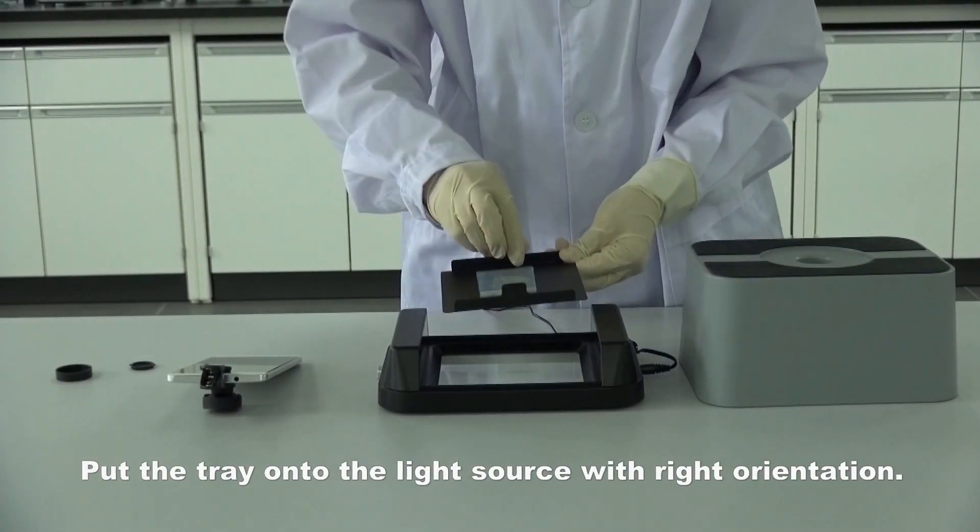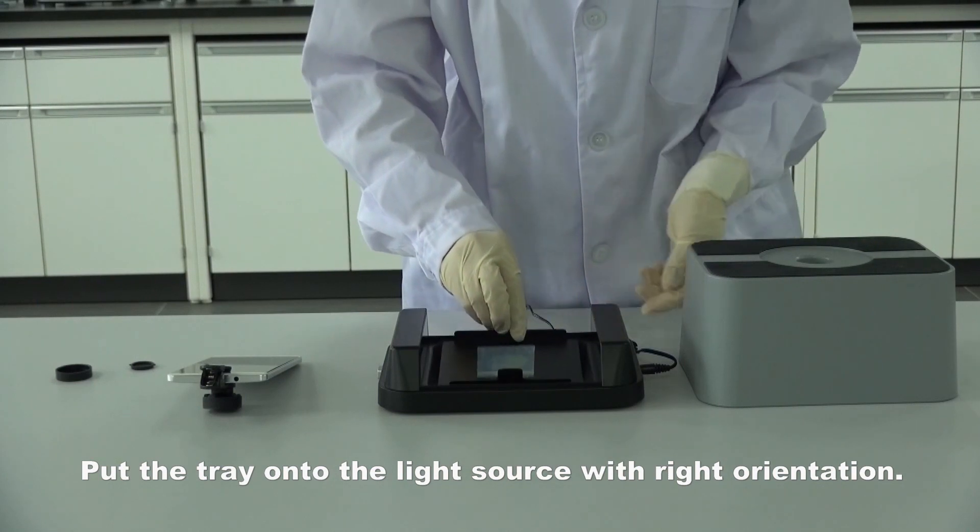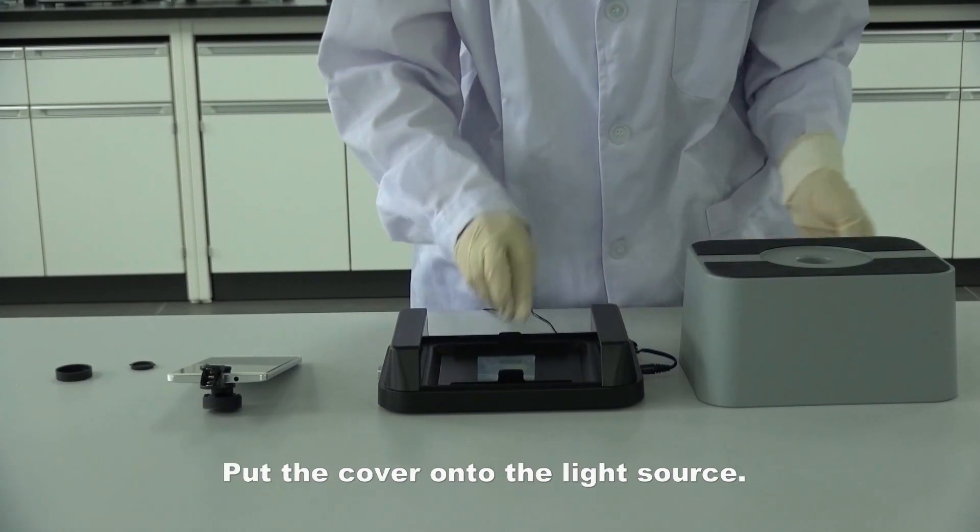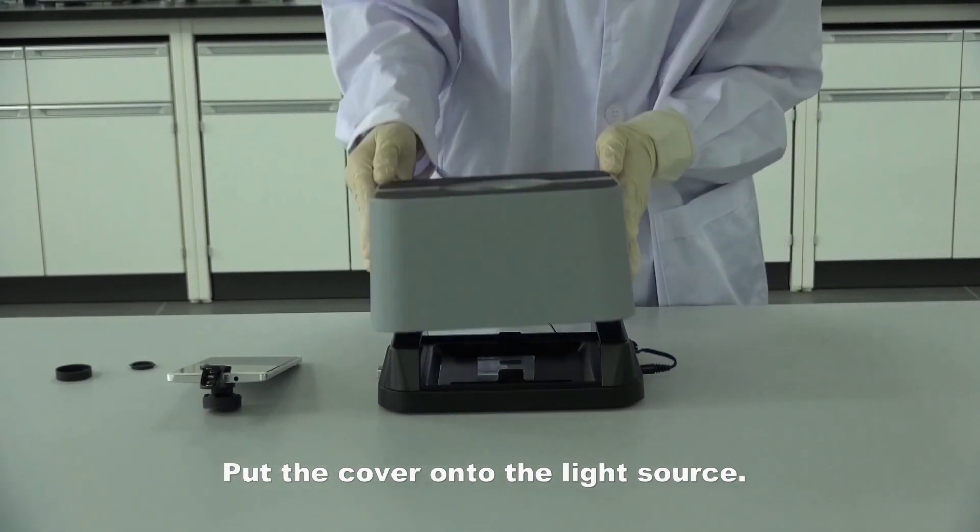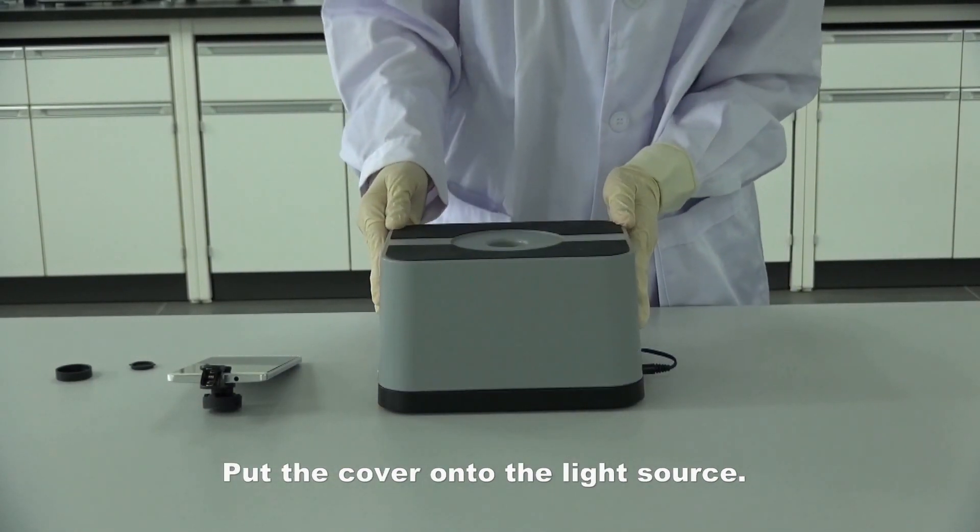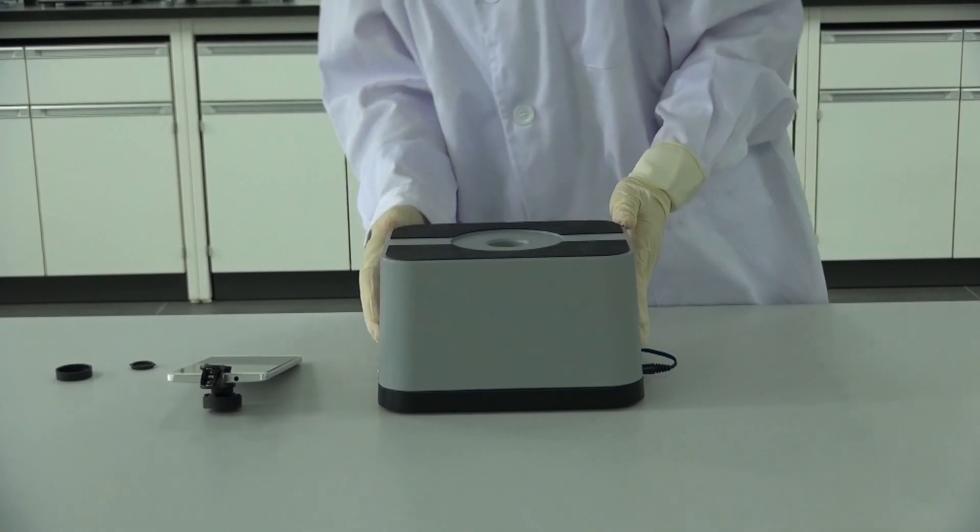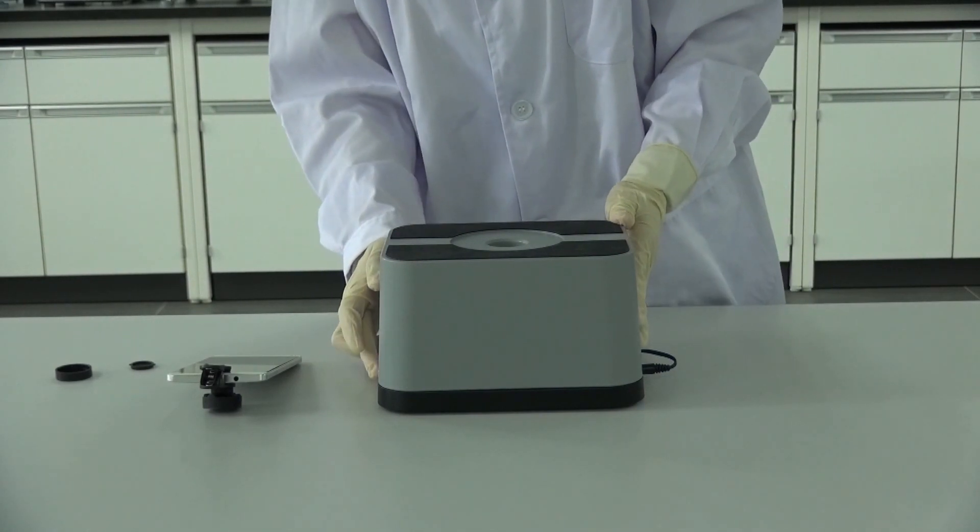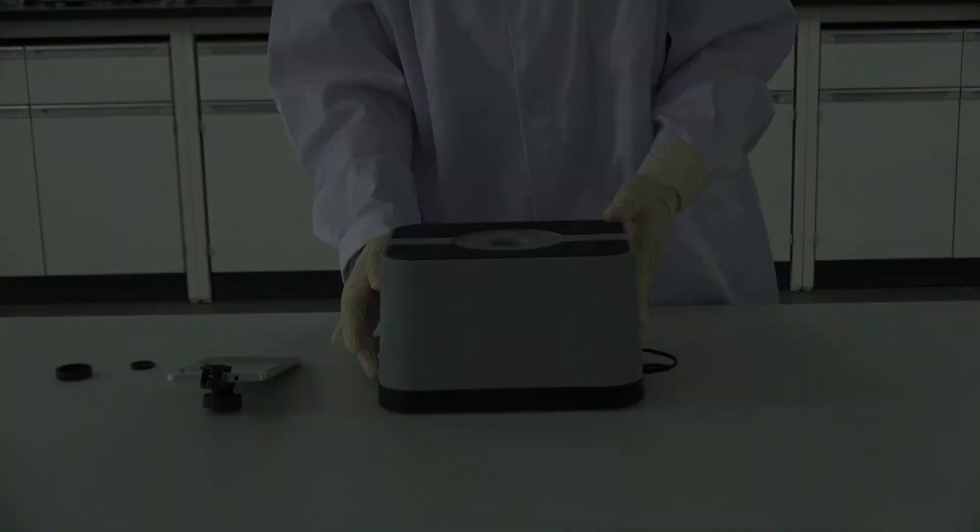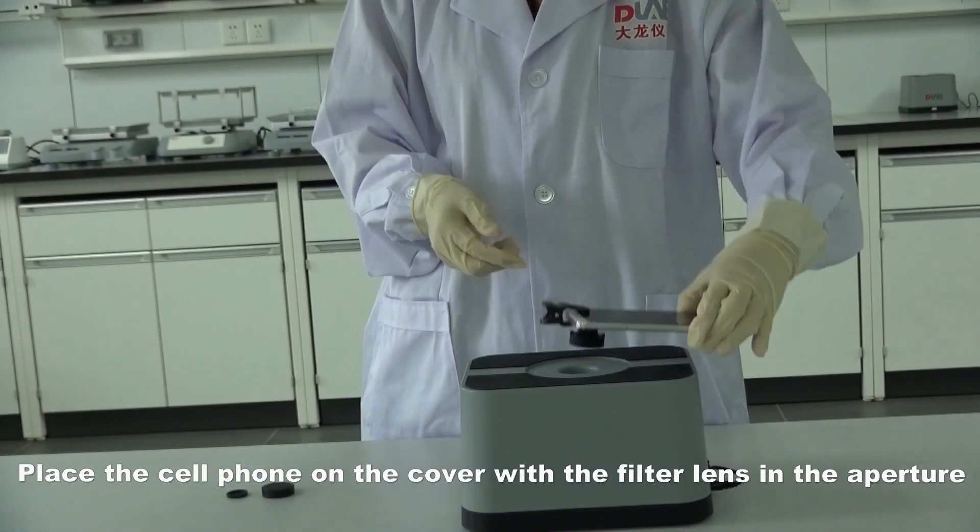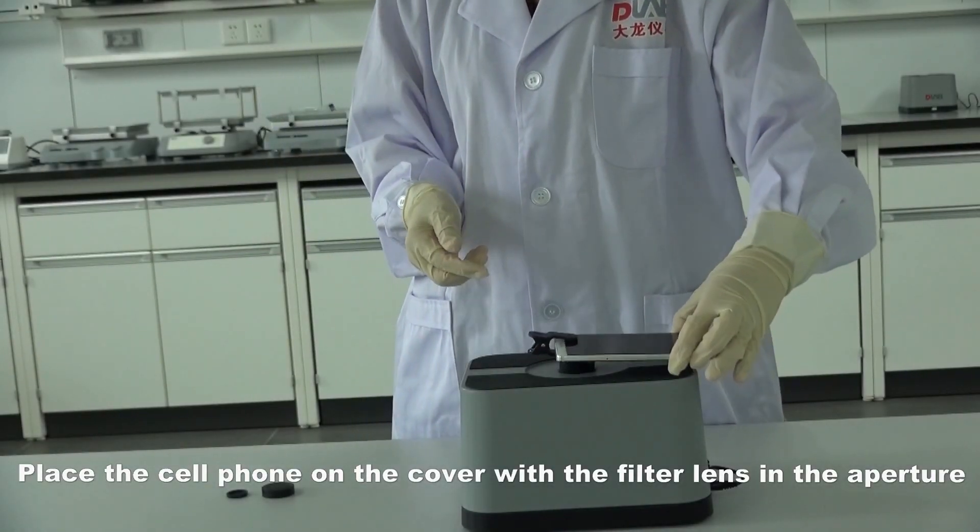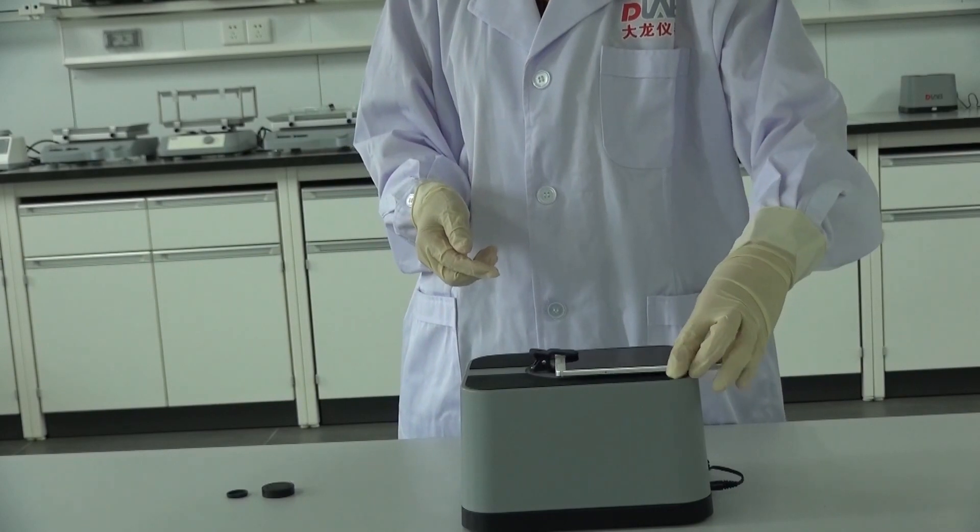Put the tray onto the light source with the right orientation. Put the cover onto the light source. Place the cell phone on the cover with the filter lens and the aperture.